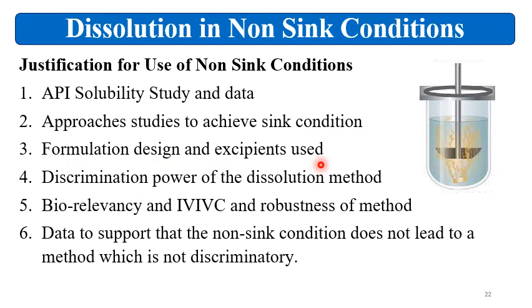Formulation design and excipient used should be enlisted, and the justification is required to be given. Then the applicant has to prove the discrimination power of the dissolution method. The biorelevancy and the IVIVC and the robustness of the method should be given and justified.